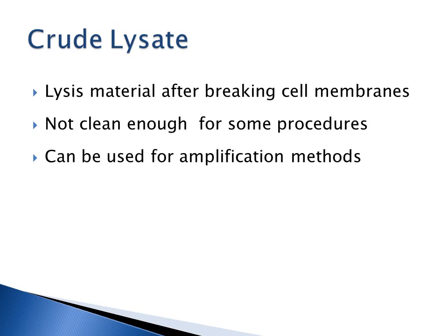So with certain methodologies, a crude lysate won't have clean enough nucleic acid to work. Crude lysates are commonly used when you're doing amplification methodology because it's very quick.